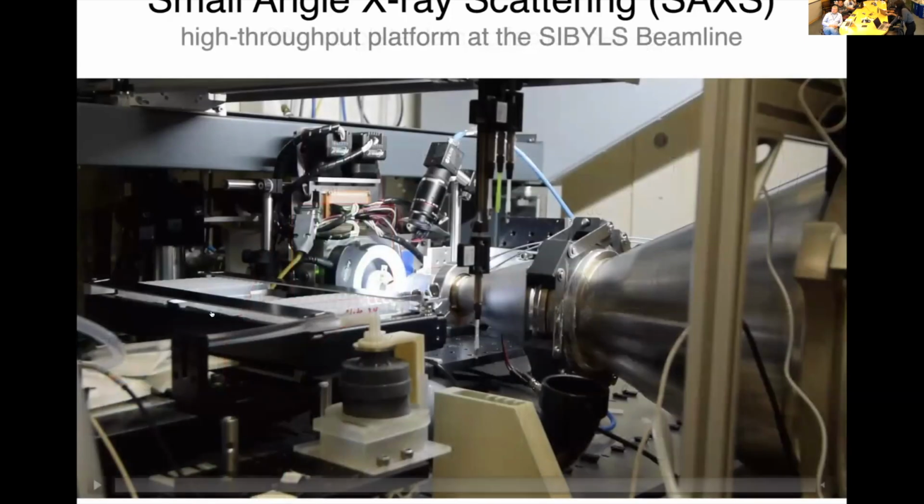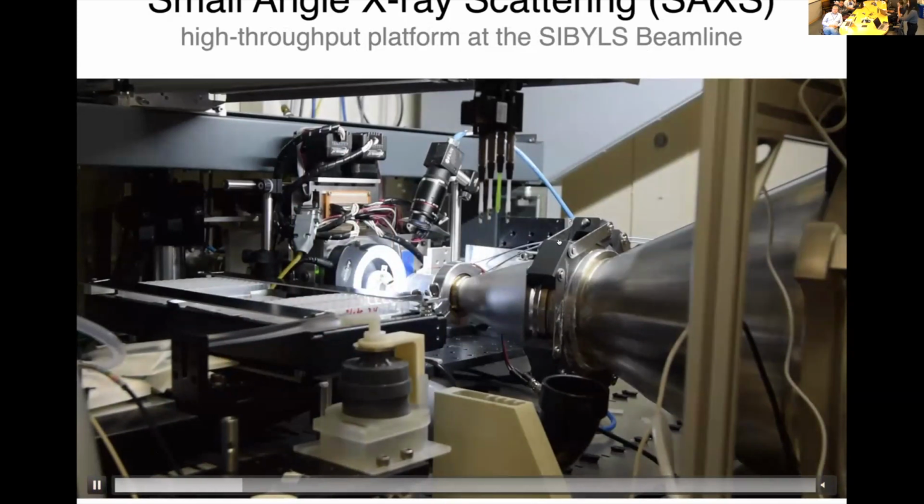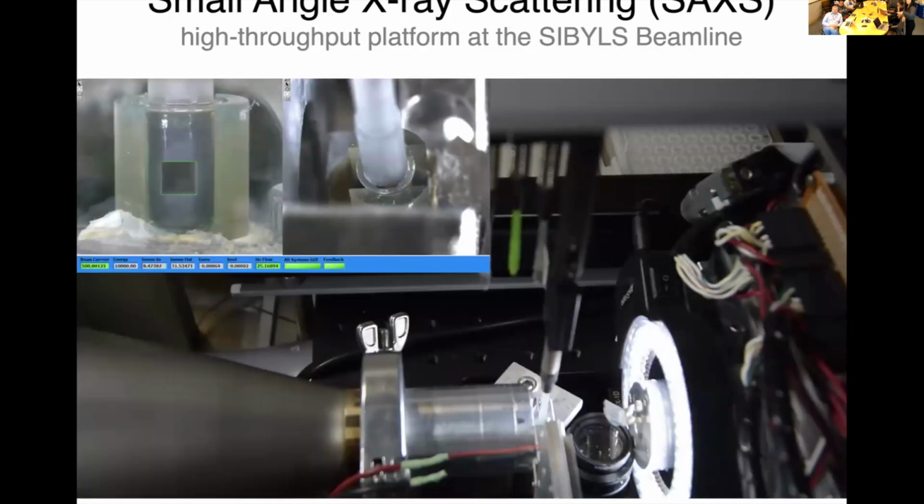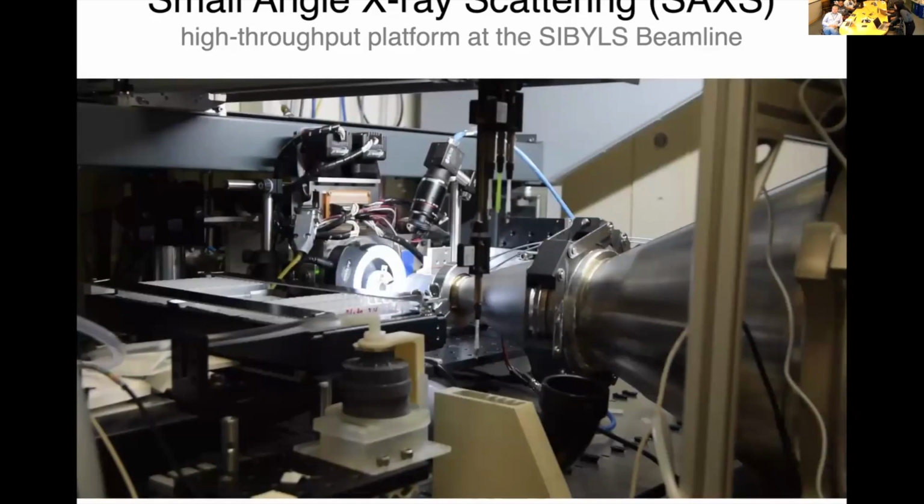So I also have a video clip that plays without sound, that shows in real time what that looks like. We have the needle reaching into one of the wells of our 96 well plate, picking up our sample and then moving it over to the path of the beam, and it just repeats itself. And we are able to run, I think, a full 96 well plate in a little over an hour. So this works quite well for me and for my collaborators in terms of testing various samples in a short amount of time in a pretty automated way. I'm pretty happy with the workflow for data collection.